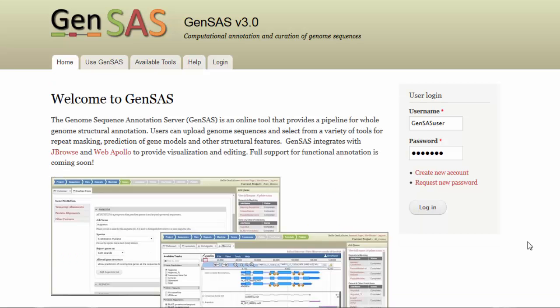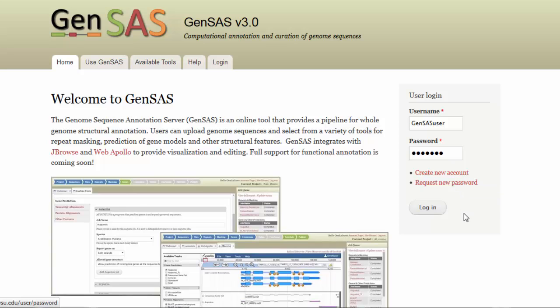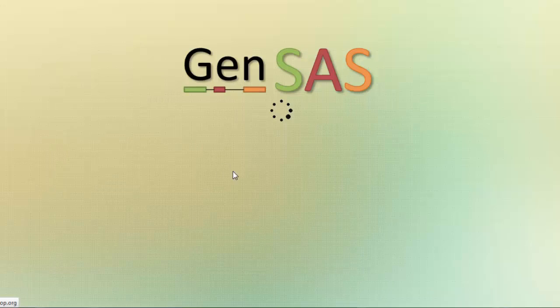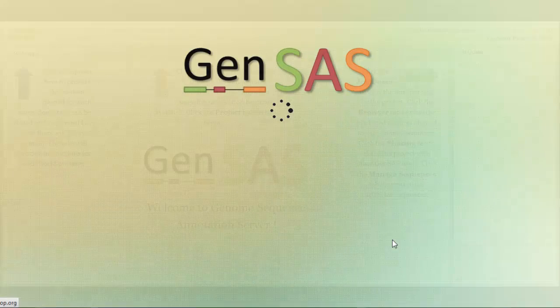The first step to use GenSAS is to request a user account. After you have a user account, you can log on to GenSAS from the homepage. Once you are logged in, you can proceed to the GenSAS interface by clicking the Use GenSAS tab.